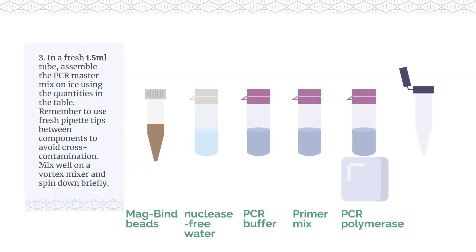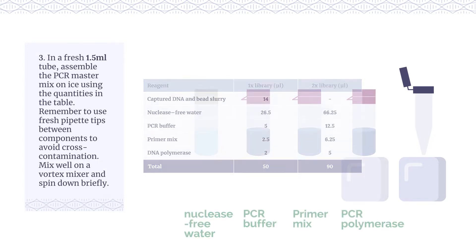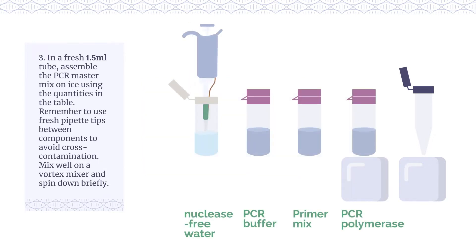In a fresh 1.5ml tube, assemble the PCR master mix on ice using the quantities in the table. Remember to use fresh pipette tips between components to avoid cross-contamination.